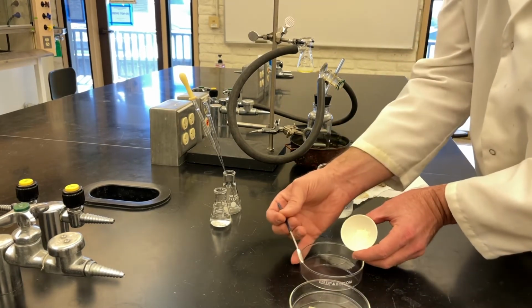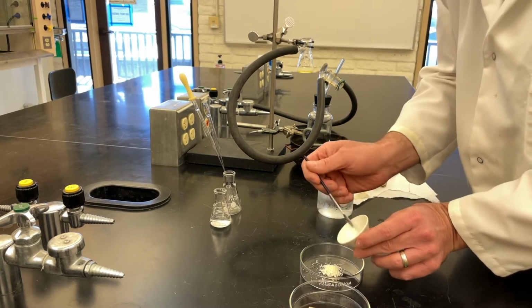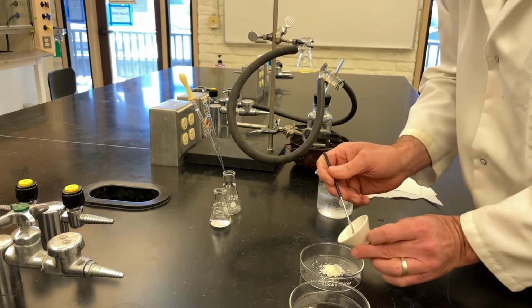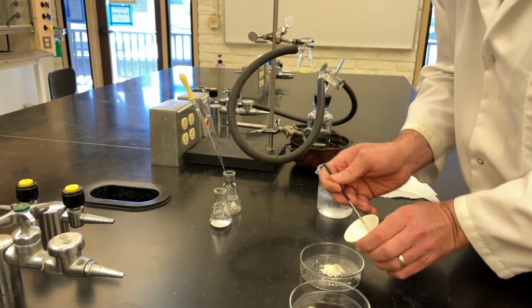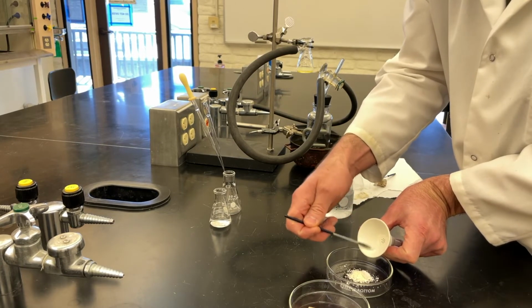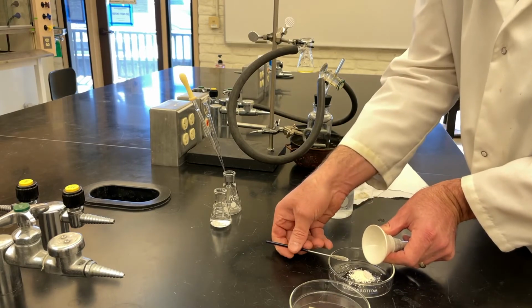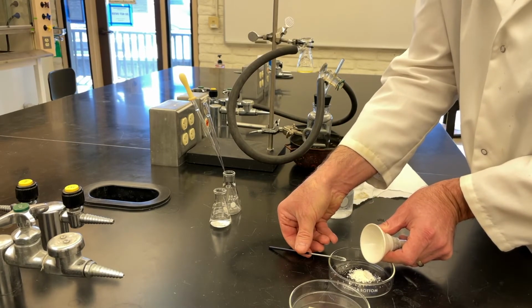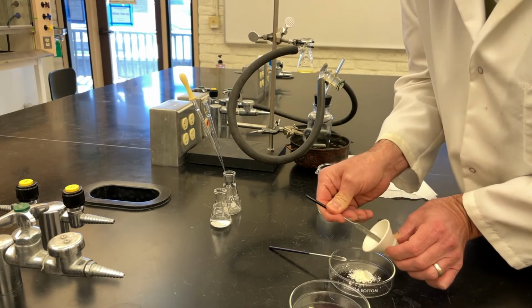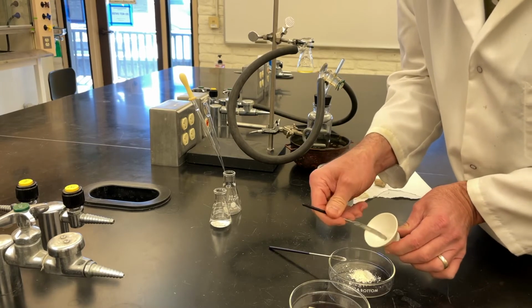Okay, and then as before, we just take this material out. A couple of good taps. Gently release the paper. And then I'm just going to switch spatulas and use a wider spatula that can be more effective at scraping out the sides.